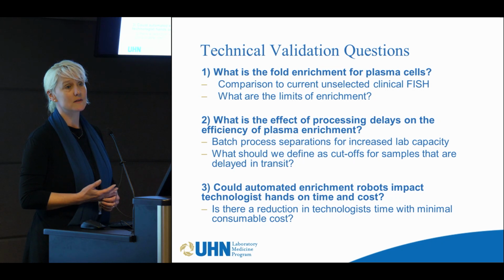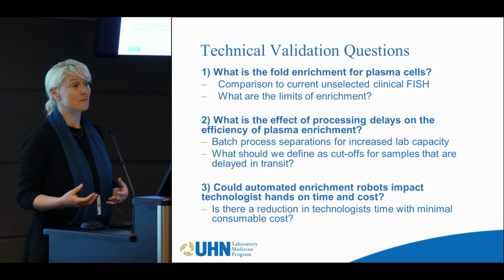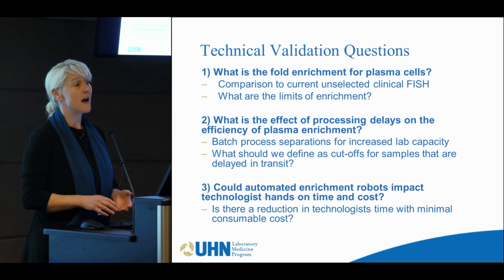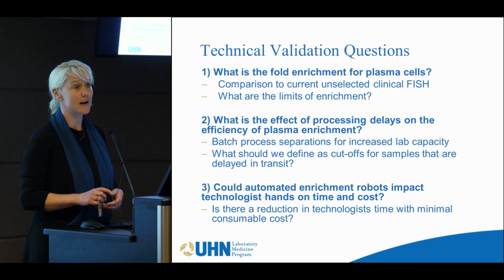And so in discussions with them, and like technical support, I'm sure all of you are involved in a lot of development. Technical support from a company is incredible, and you learn a lot, and we worked very closely with them. And it was determined that we could put our samples upon receipt in RPMI media and store them in the fridge.